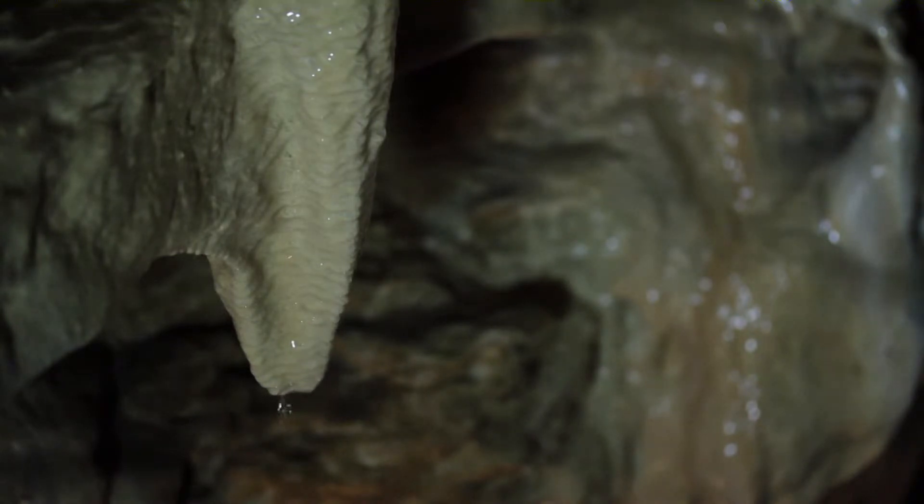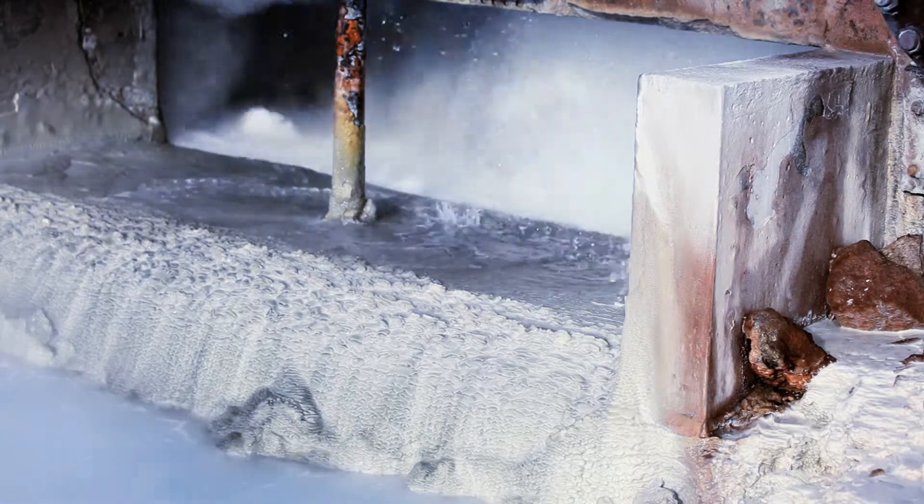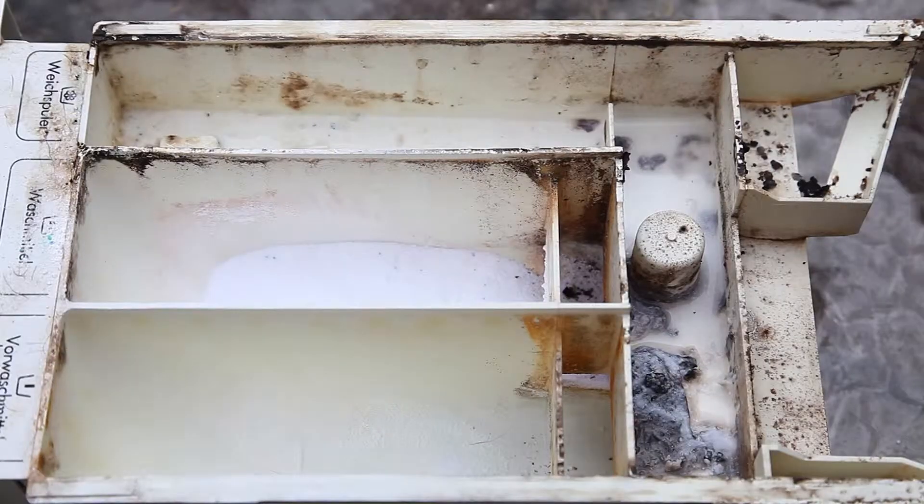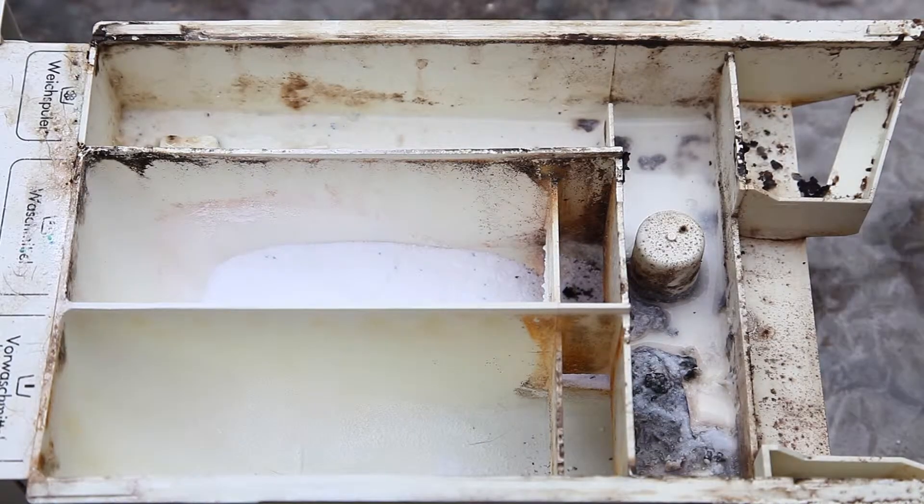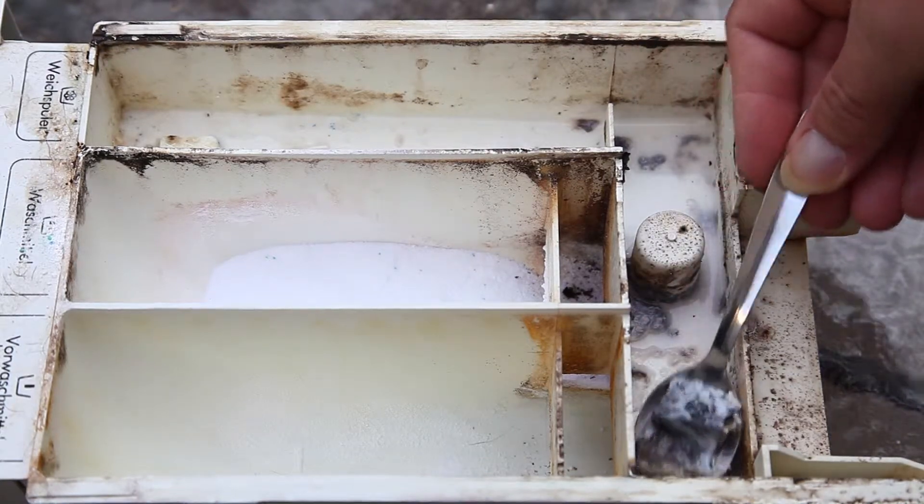Knowing the total hardness of water is important for controlling scale buildup in drinking water systems and boiler heat exchangers. It also affects certain cleaning agents, turning them into scum and diminishing the formation of suds.